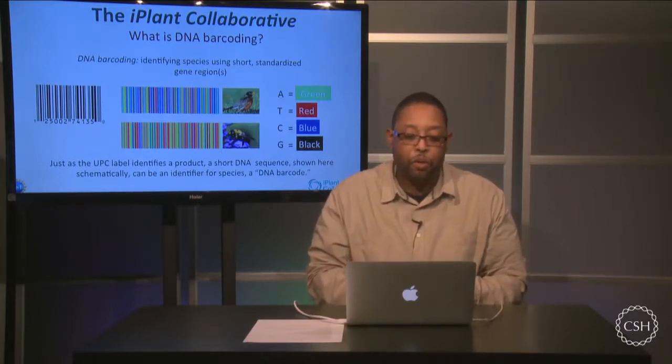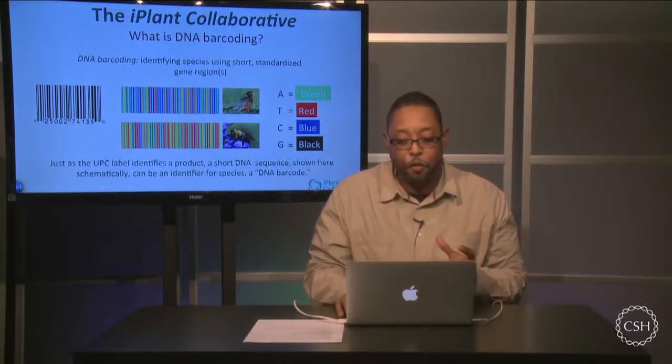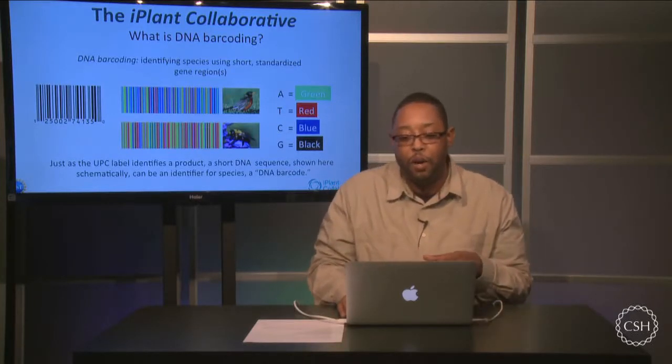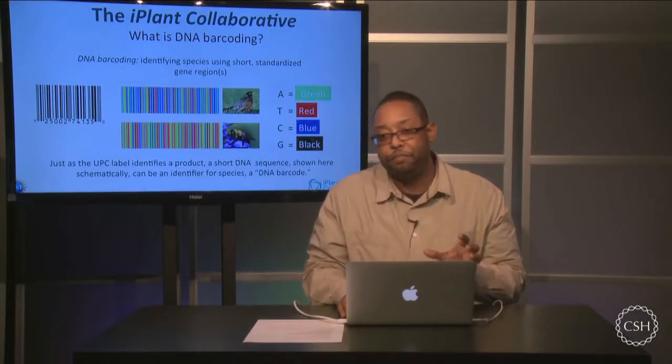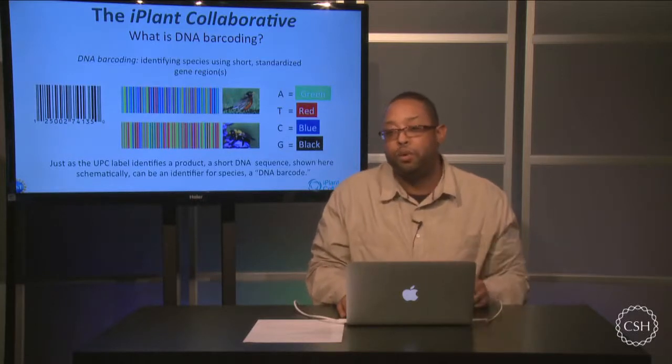So what has to be special about the barcode? Well, in order for it to go across species, because we're not doing genomics here, we're taking one individual section of DNA, a targeted gene, and trying to span as many species within the group as possible.